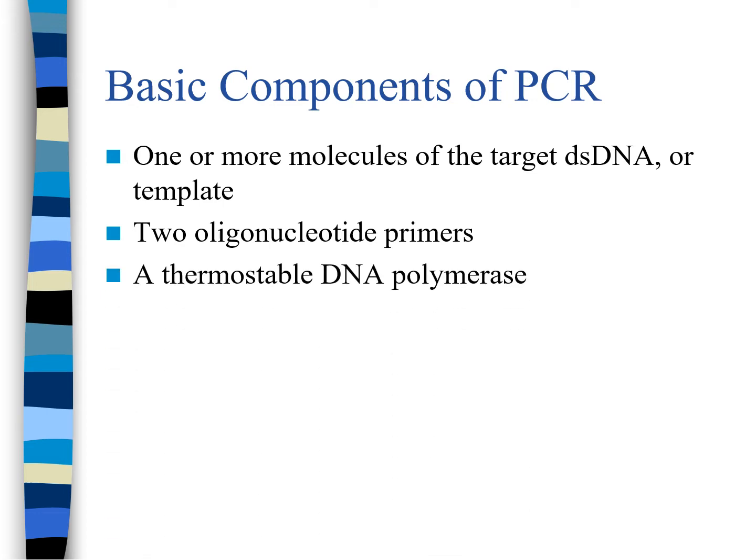And then we have an enzyme, a special DNA polymerase that is thermally stable. It's called the Taq polymerase, which is important for the extension part of the cycle. Then we have the different nucleotides, the dNTPs, where D stands for deoxy: ATP, GTP, all the different nucleotides. And then we have the reaction buffer, which is basically food for the enzyme. Taq polymerase needs food, so it has salts, etc.